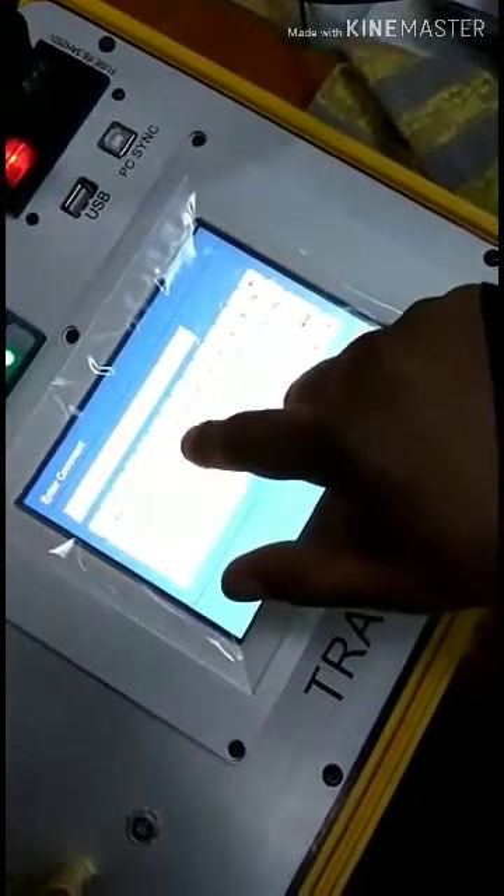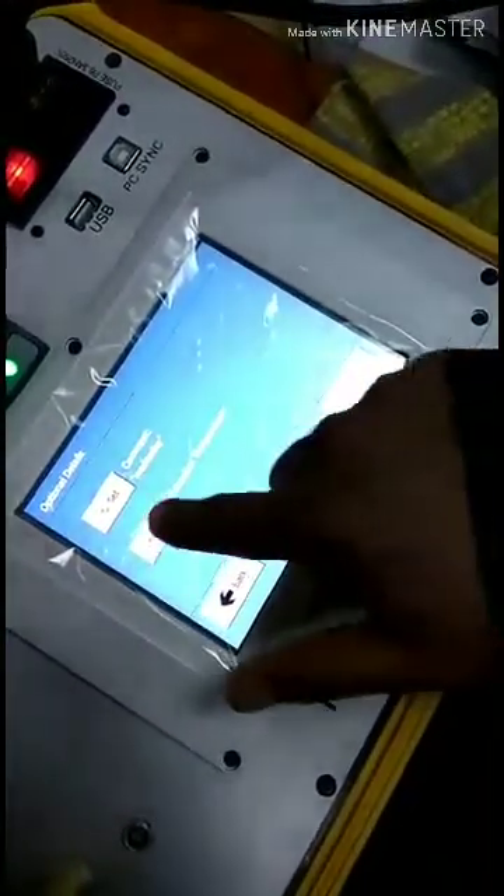Temperature, then temperature data transfer. Temperature, temperature, room temperature — okay, like with the coin, just cool.